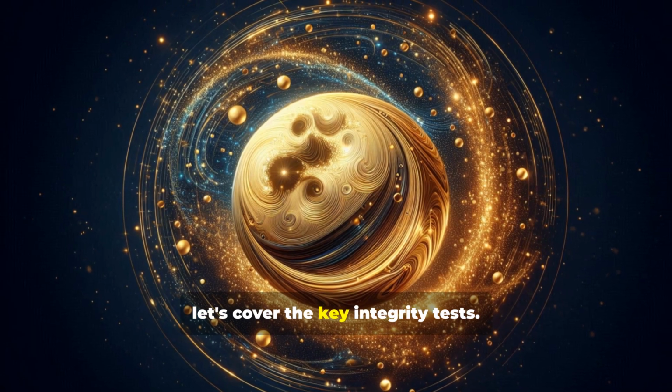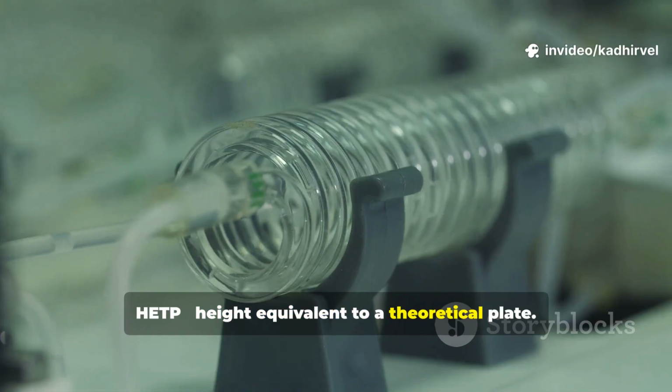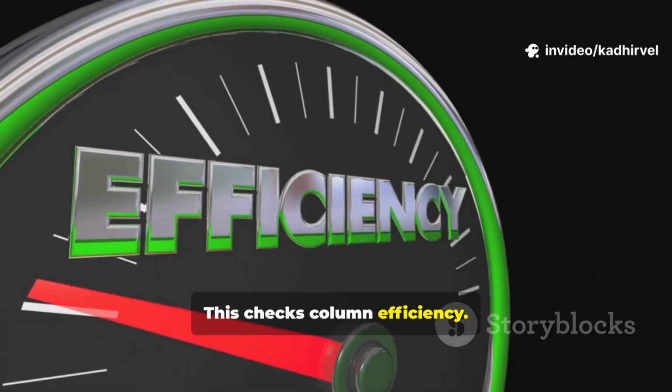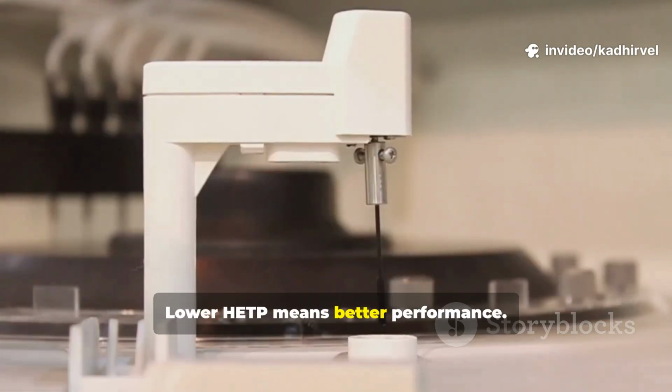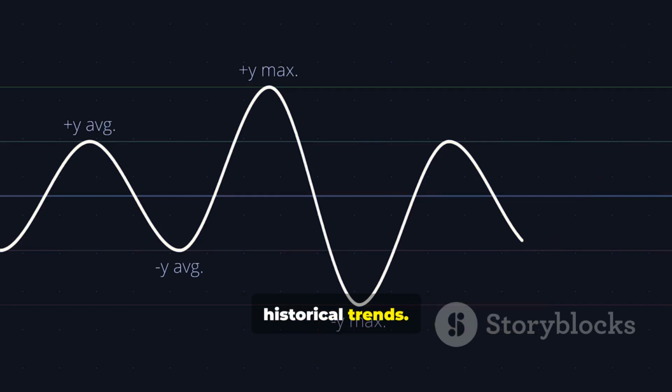Now, let's cover the key integrity tests. HETP, height equivalent to a theoretical plate. This checks column efficiency. Lower HETP means better performance. We compare HETP against vendor specs and historical trends.